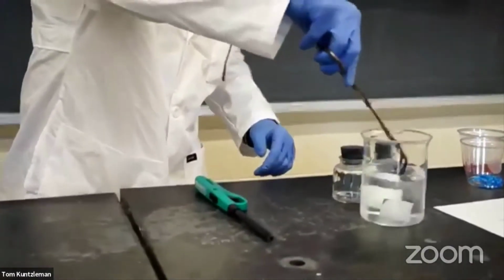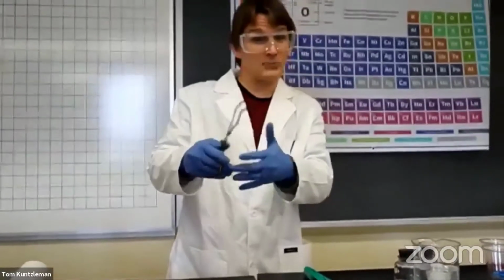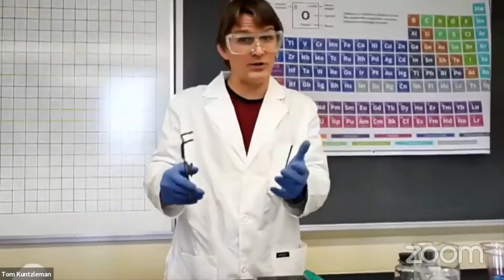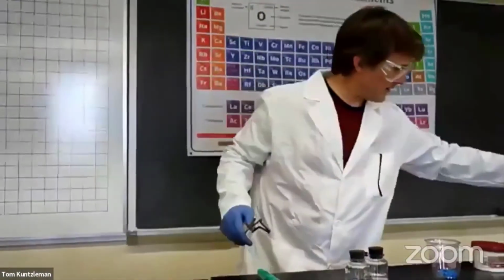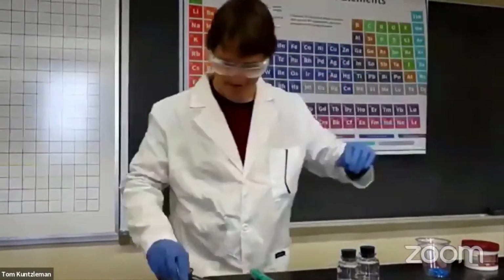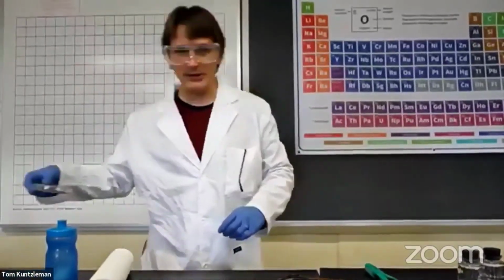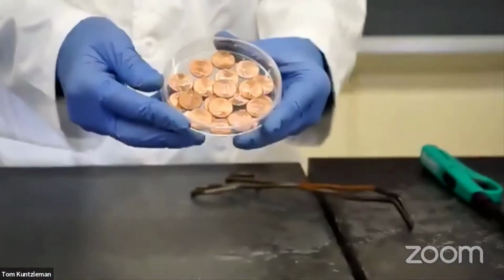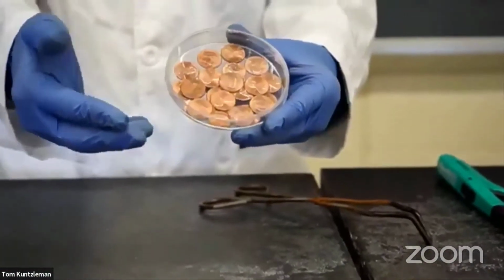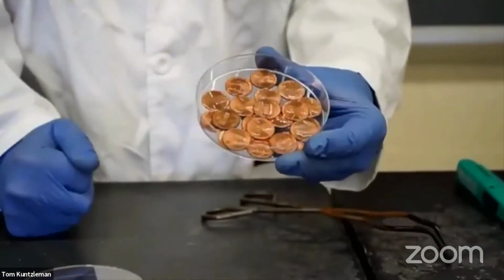All right. So let's remember that copper, when it gains energy, gives off a greenish color. More experiments. I think you're familiar with these. Some pennies. And you're probably aware that pennies have copper in them. We can see that nice orange color from the copper metal.